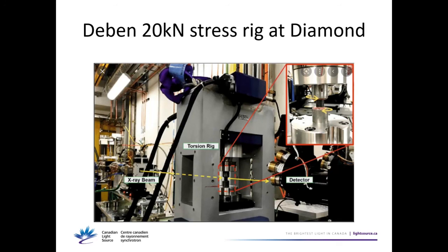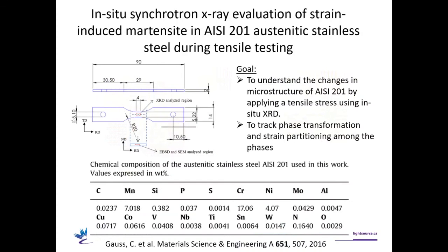And this second one should have also temperature control, so that you can also control the temperature and stress your sample back and forth and maybe see how phases change, see if the crack forms, follow the crack. And I'm going to show some examples of research that can be done here. For example, this is an in-situ tensile study of austenitic stainless steel during a tensile testing.